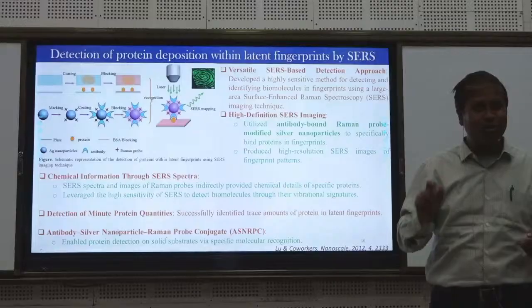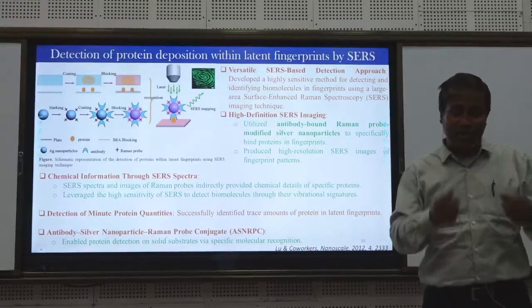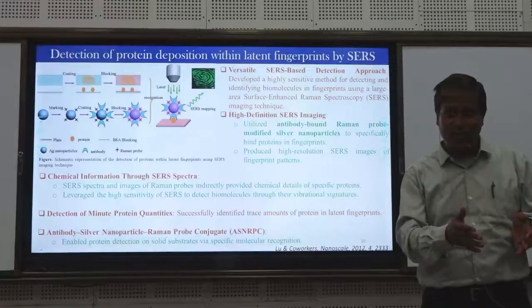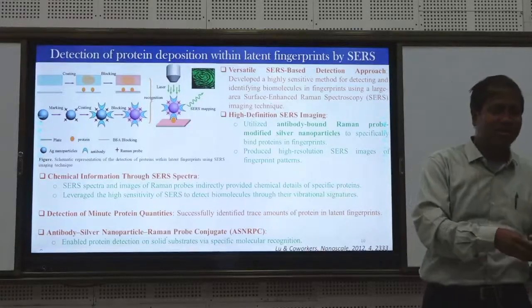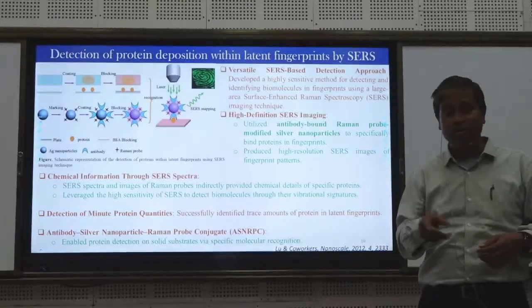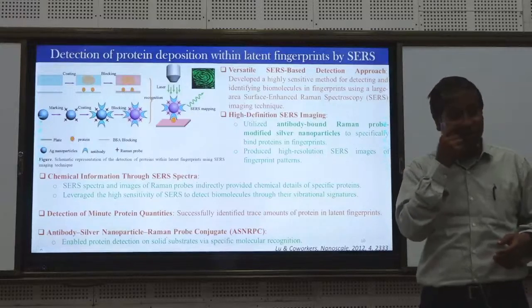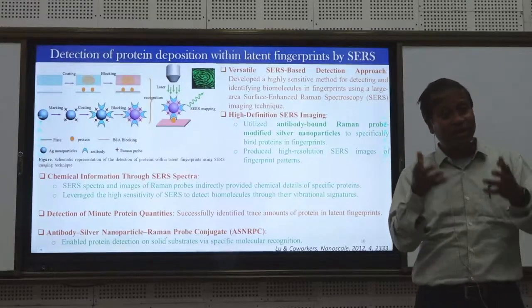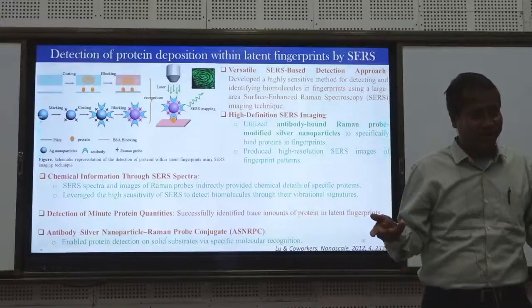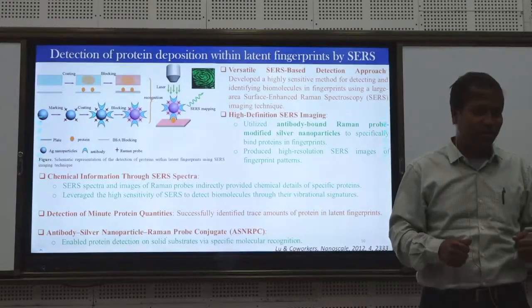Then when somebody told him this is the glucose solution, he immediately became careful, because it appears like a water solution. But the person who gave the sample said there is glucose in it. And finally he got some glucose peak, glucose, sucrose, whichever it is, that peak he got. So apparently the spectrum doesn't look different, so analysis is very important.